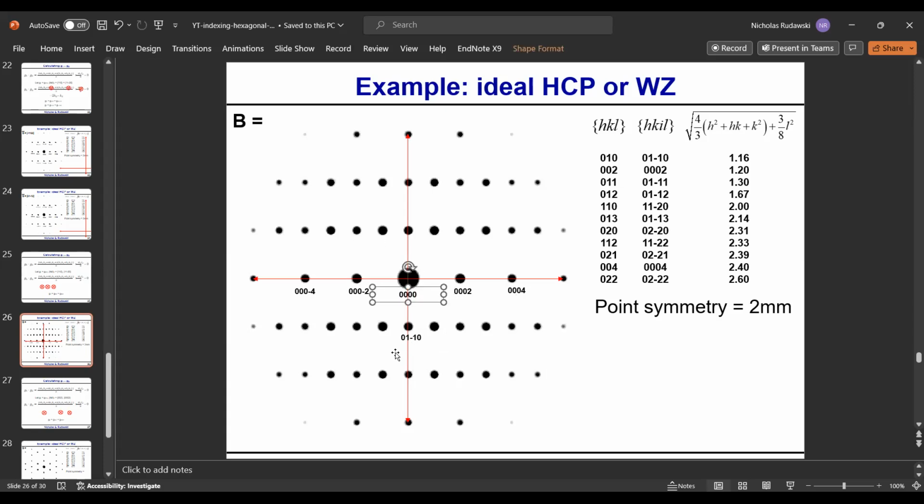You can see some of these spots just get really tight with the spacing. So right here, add this to this. So we have 0, 1, 1 bar, 2. Do the opposite: 0, 1 bar, 1, 2 bar.